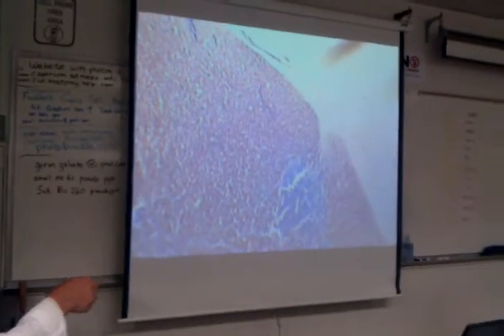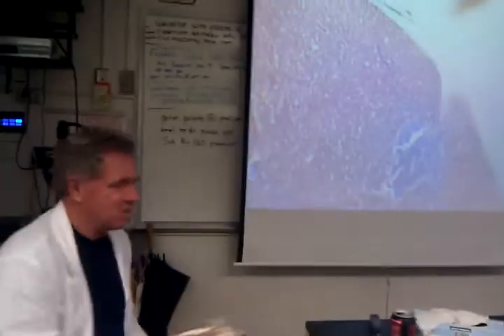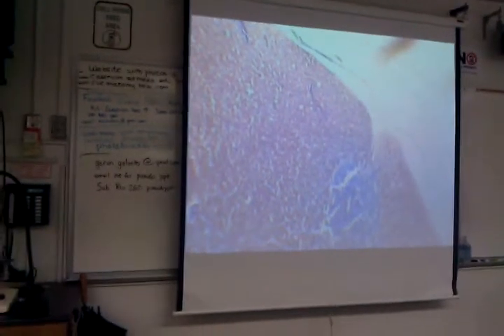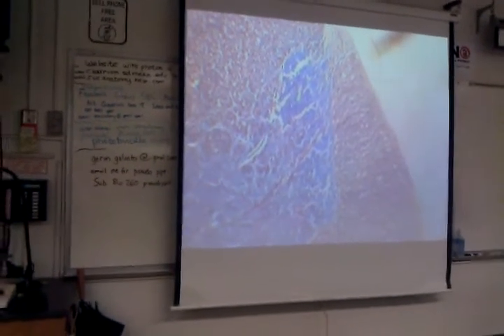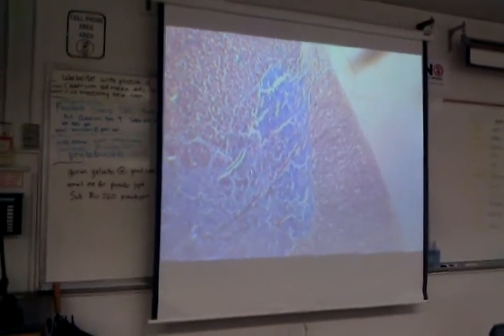So it comes in here. Now all of this stuff around here, these are the white columns. Those are the myelinated axons. So now the sensory information comes in right here. And this is low power. You wouldn't see any higher than this. This is the posterior gray horn.